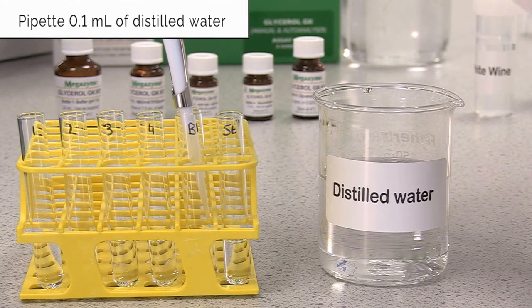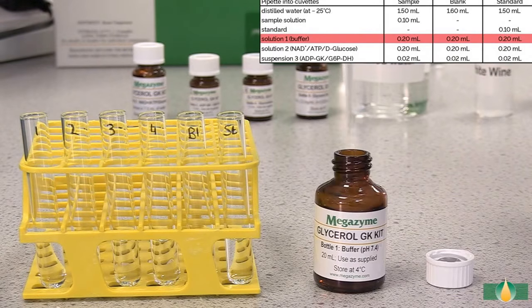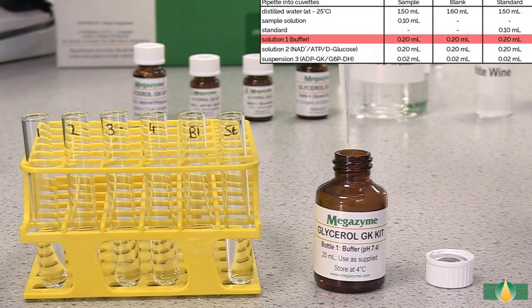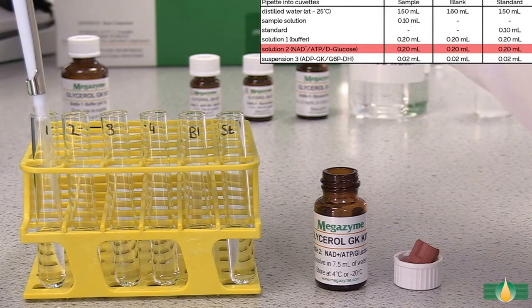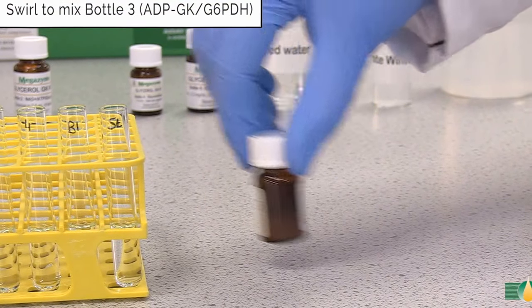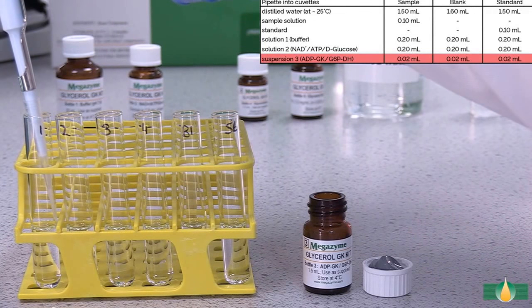Pipette 1.5 millilitres of bottle 5 kit standard into the standard assay tubes. Pipette 0.2 millilitres of solution 1 into all assay tubes. Pipette 0.2 millilitres of solution 2 into all assay tubes. Swirl to mix the contents of bottle 3 prior to dispensing, then pipette 20 microlitres of suspension 3 into all assay tubes.